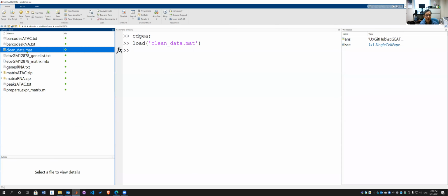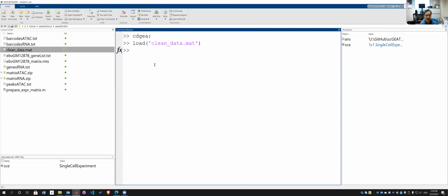Their B cells were collected and infected with EBV virus. And then after the establishment of lymphoblastoid cell lines, we collected the cells and sent them to this 10x Genomics machine to prepare the cells and get the single cell RNA-seq data. I already processed the data and got the expression matrix and also gene expression level.